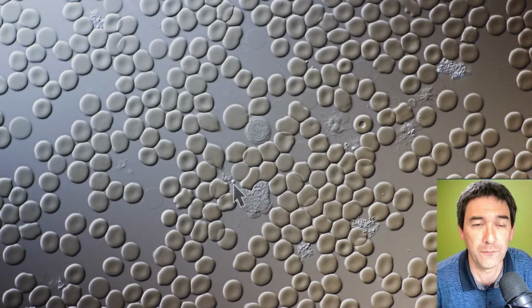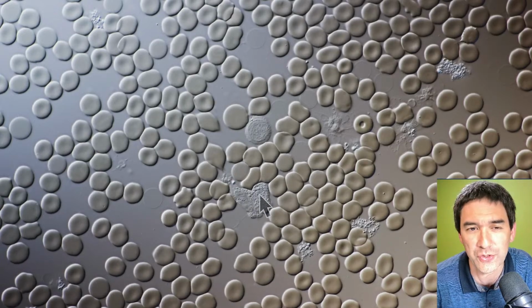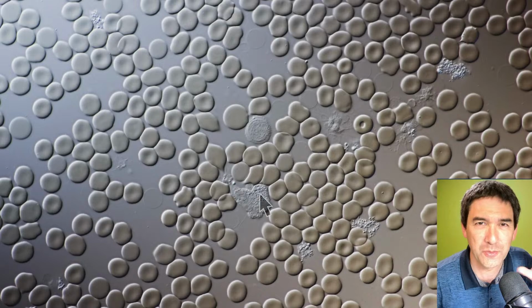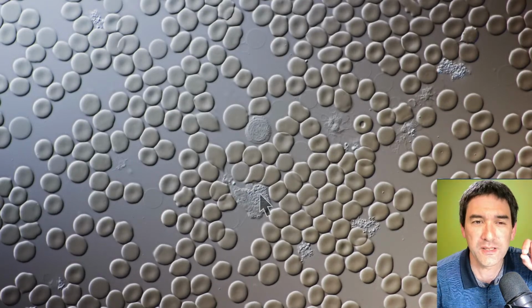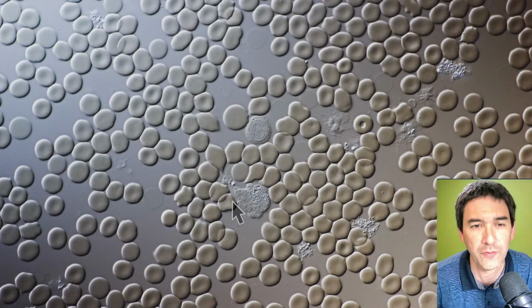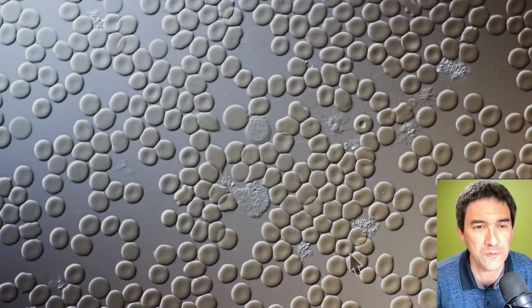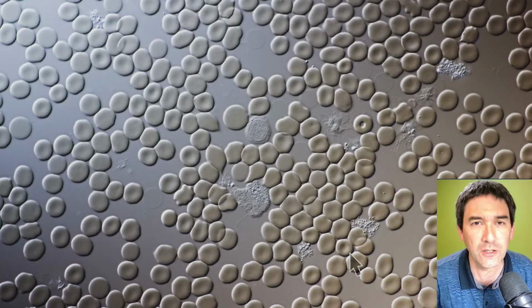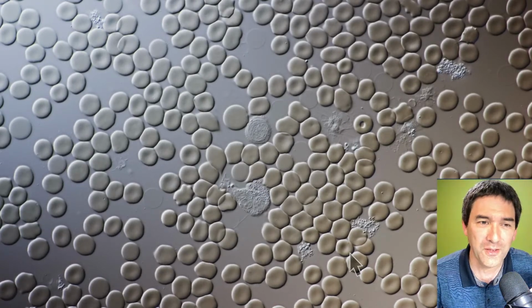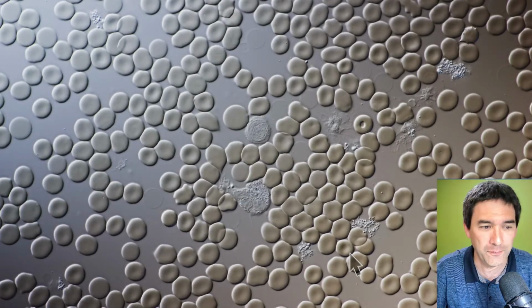Because in my first time lapses, I used a little too much blood. I was able to find some of those white blood cells as well, kind of hiding between the red blood cells, because there were so many red blood cells, and they also moved vertically, and then they were in and out of focus, and I could not see them moving quite well. So this one, no coagulant, just regular blood under the microscope slide with a lot of experimentation until I got the right amount of blood, and I looked at the right place on the slide, so that essentially the blood cells were scattered apart properly.